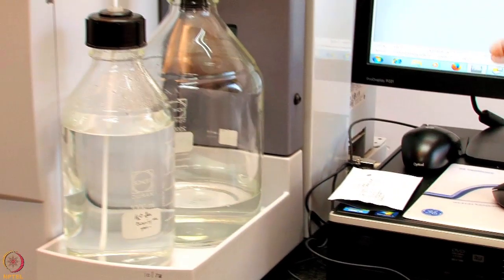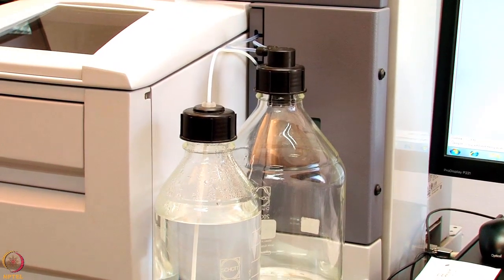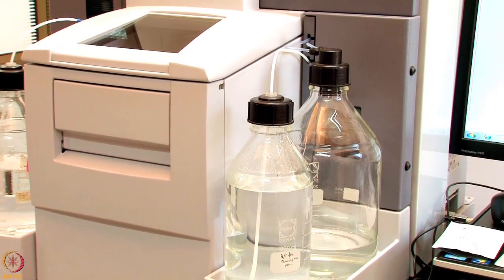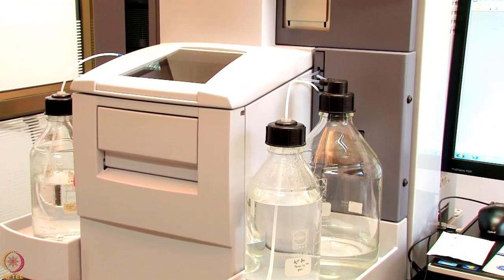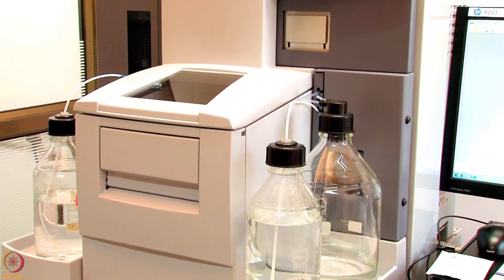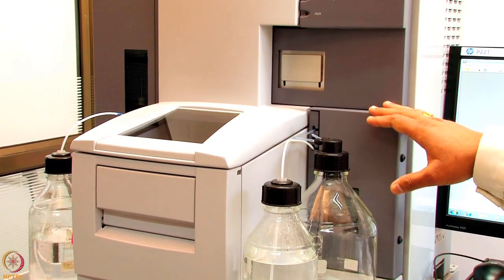Now the chip is getting docked. So we have connected a new buffer. We will prime the system. Priming is a process of sending buffer through the IFC and equilibrate the system before our experiment.